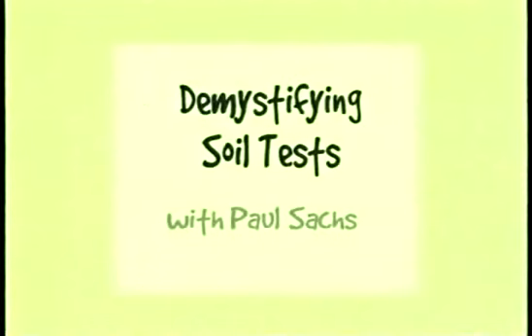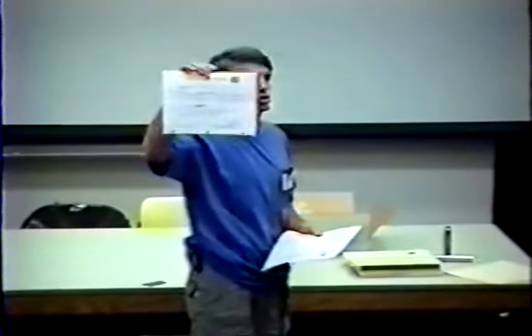This is just something I printed up in a hurry. A little overview of soil testing. I tried to cover it somewhat from soup to nuts. On the back of this sheet, you'll find an example of an A&L laboratory soil analysis, and we can go over that.